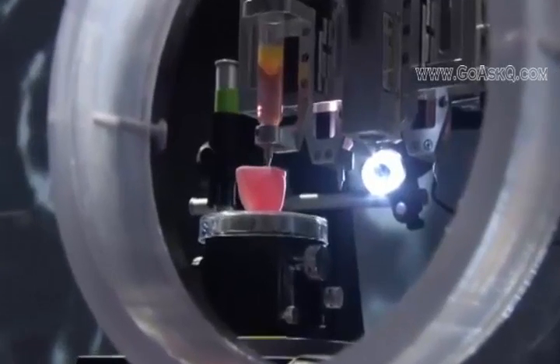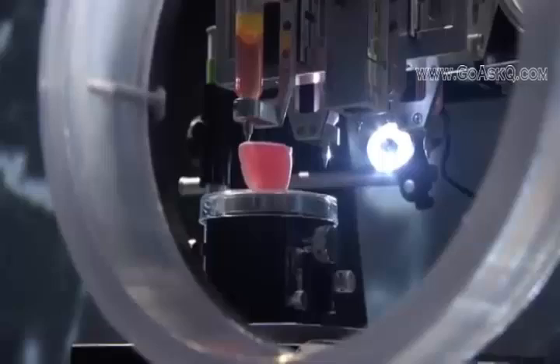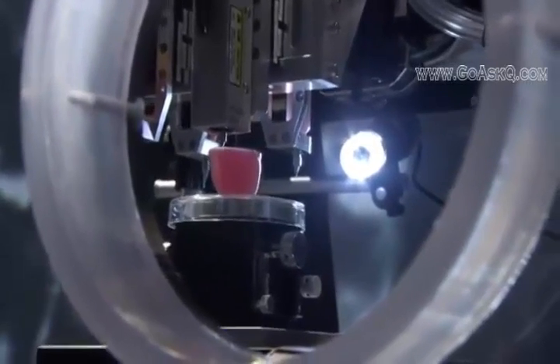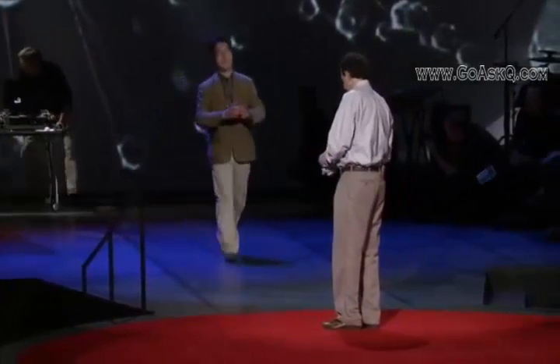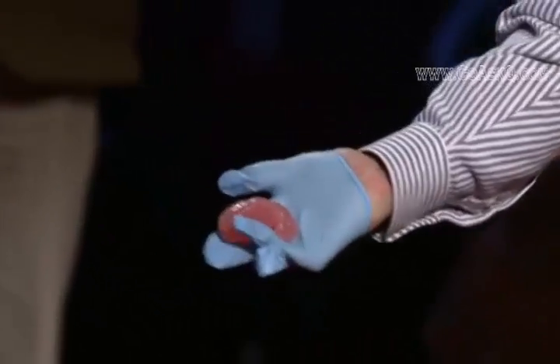It takes about seven hours to print the kidneys — this is about three hours into it now. Dr. Kang is going to walk on stage right now, and we're actually going to show you one of these kidneys that we printed a little bit earlier today. So these gloves are a little bit small on me, but here it is. You can actually see that kidney as it was printed earlier today.